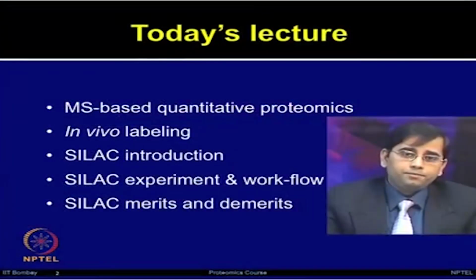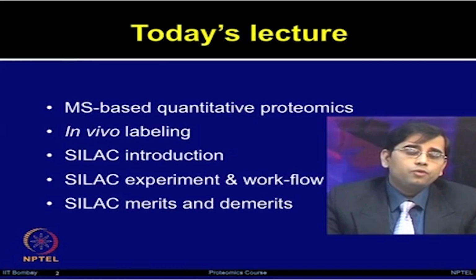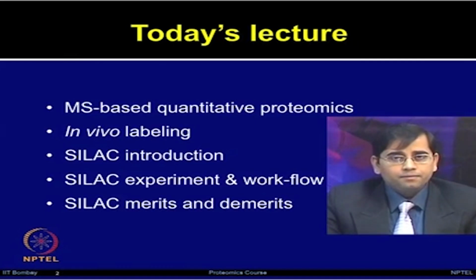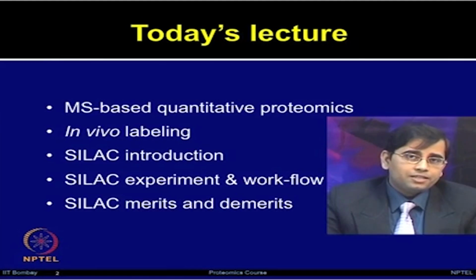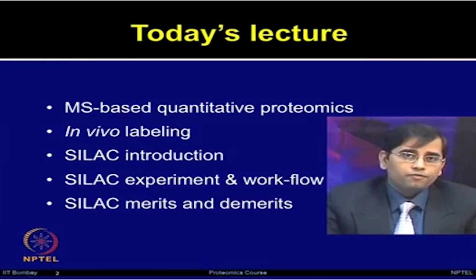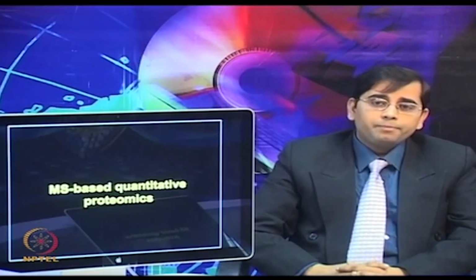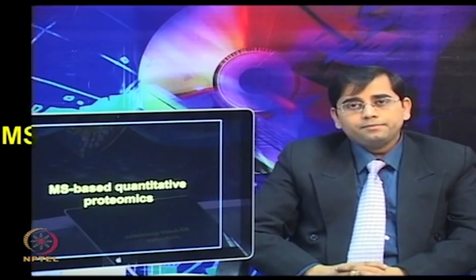So, in today's lecture, we will first discuss MS based quantitative proteomics, in vivo labeling methods. I will introduce SILAC and then we will talk about the SILAC experiment and the step by step workflow. We will then discuss the merits and demerits of the SILAC method. So, let us start with MS based quantitative proteomics.